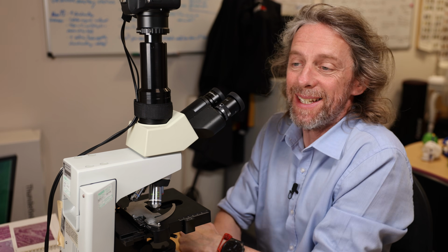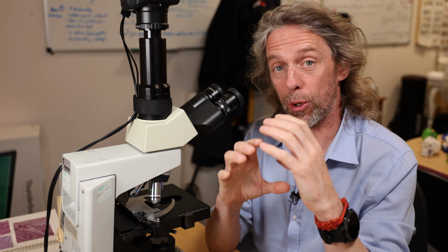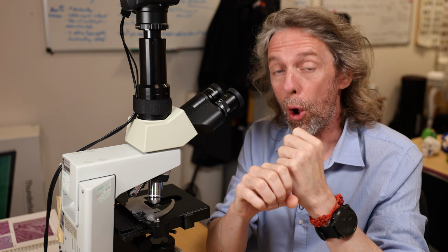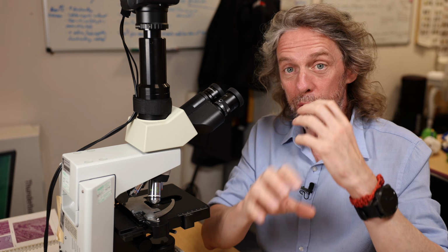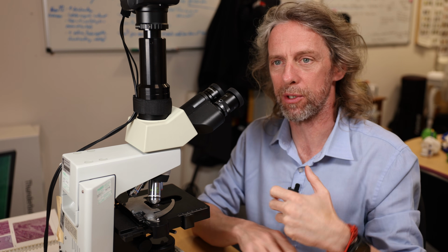Right, bring it on, the histology of the stomach. Last week we were looking at the histology of the esophagus, and I said that the organisation of the layers of the esophagus would be the same throughout the gastrointestinal tract. So I guess we get to find out today if I'm talking rubbish or not.